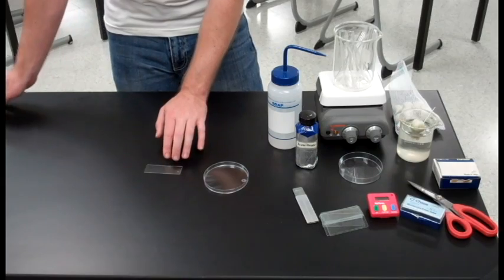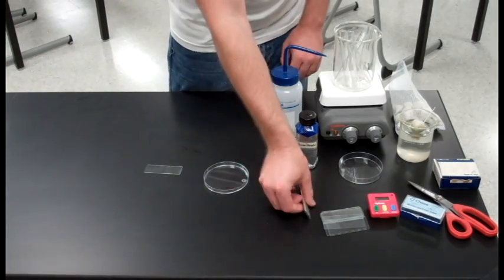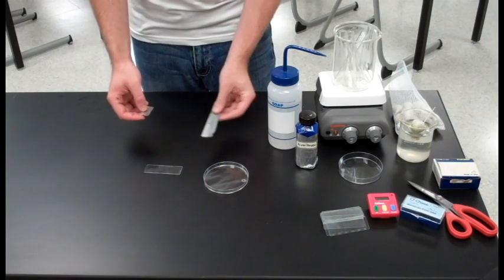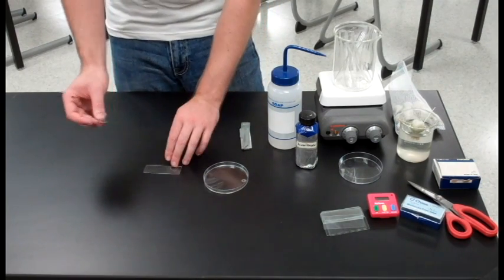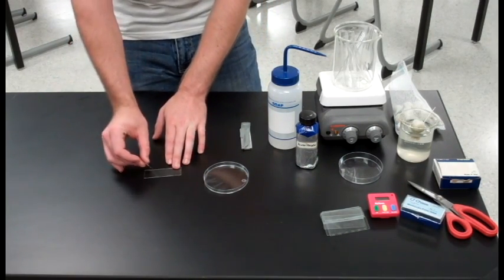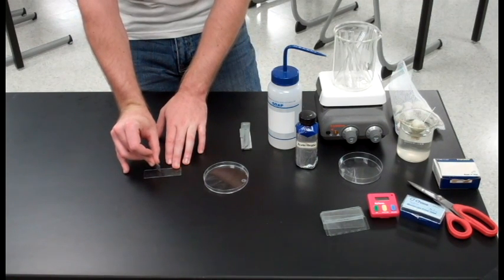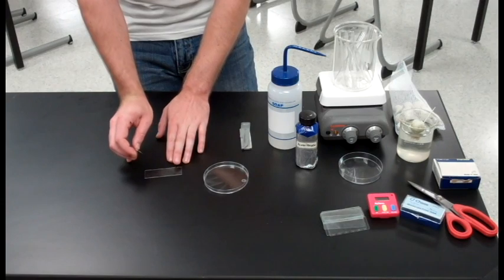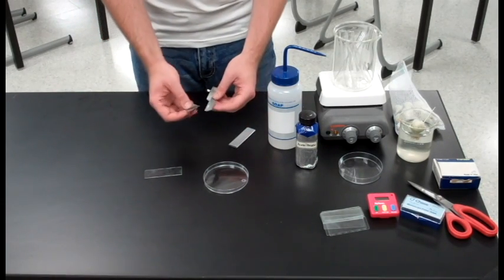Once we have it on the slide, we're ready to cut off the very tip. Remember the cells at the tip are the ones that are dividing the most. So we'll take about two millimeters from the very tip of the root and discard the rest.